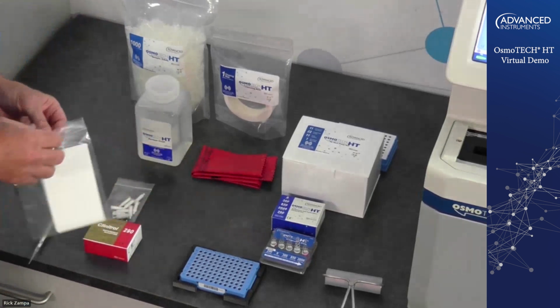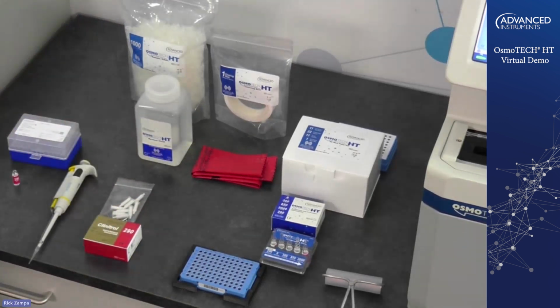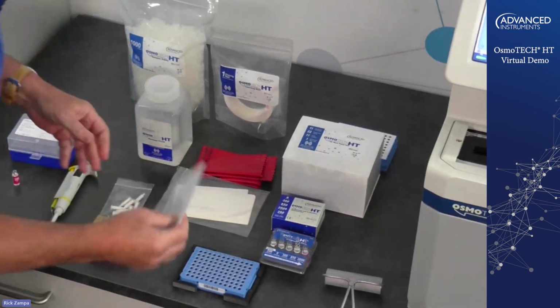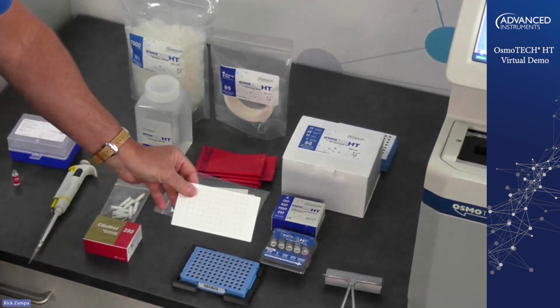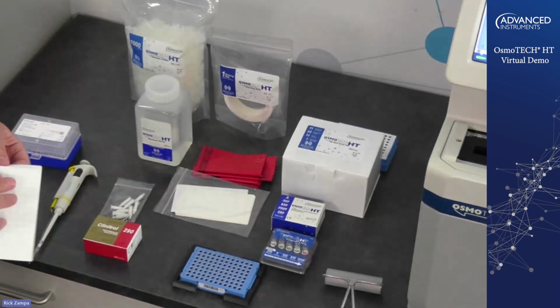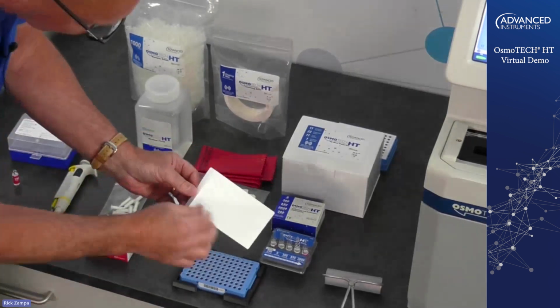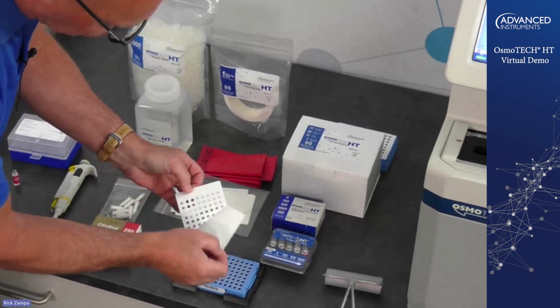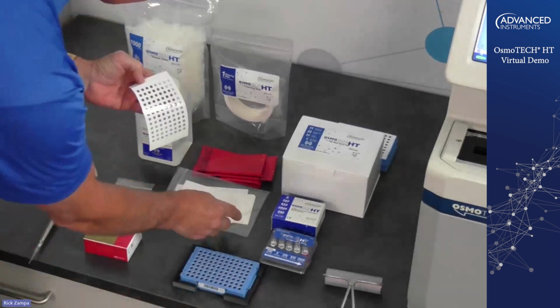Although we're only running 2 samples, if I was loading more of the plate, I would obviously need an evaporation cover, which would be much more important. But in this particular case, I'm going to show you how to put the evaporation cover on. The evaporation cover has 2 little tabs at the end. You peel off the middle section.